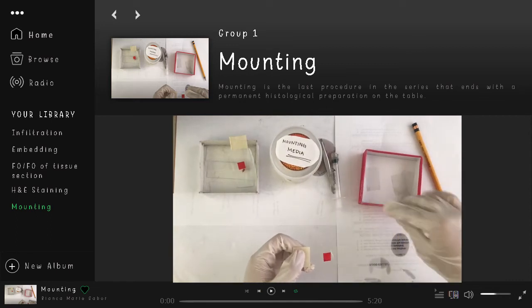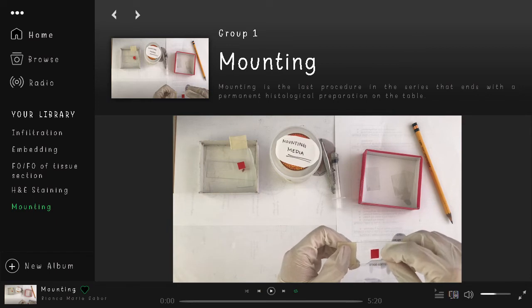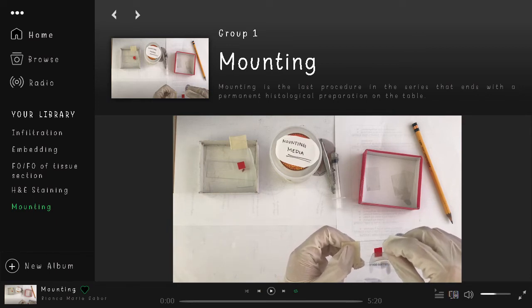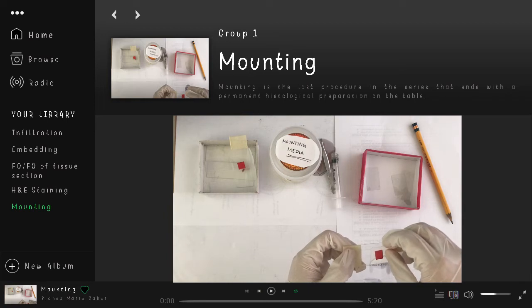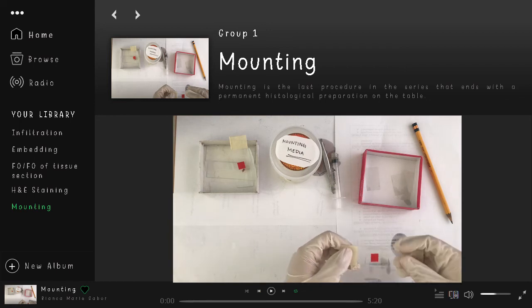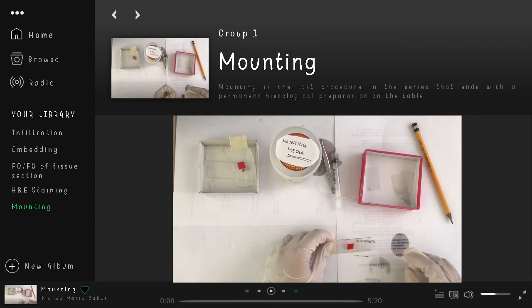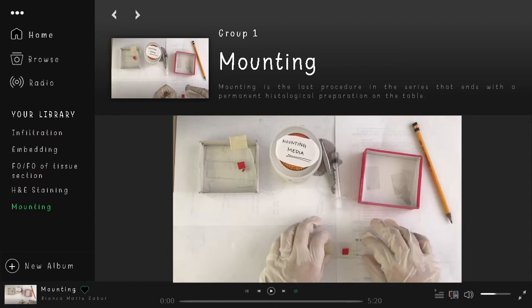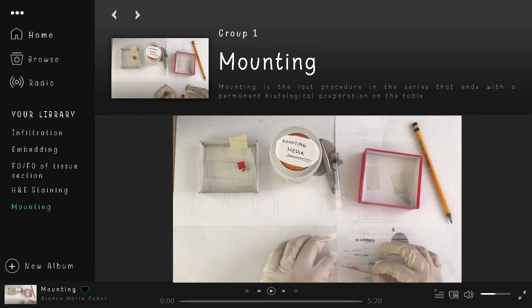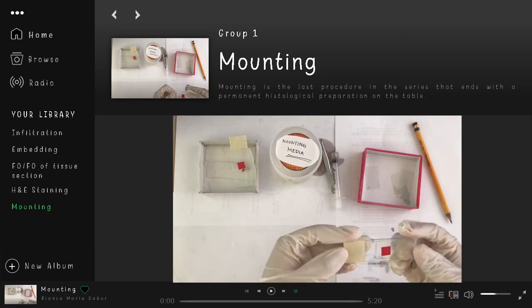Next, we get our cover slip and we gently put our cover slip. Now we put the glass on the sides to avoid any excess. It spreads under the cover slip and the slide with the cover slip attached is quickly inverted and there.